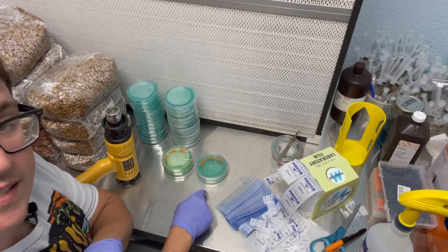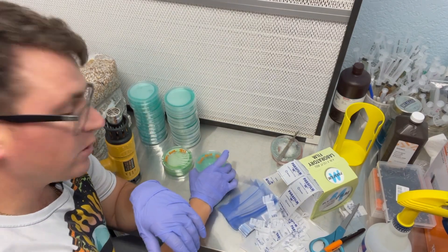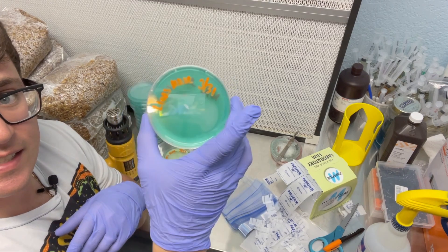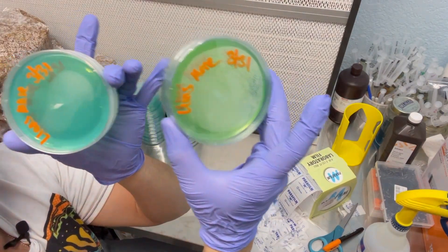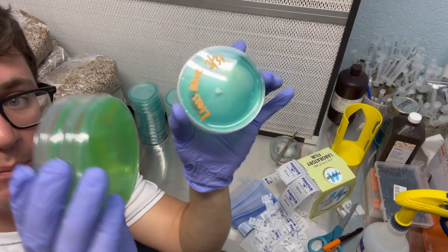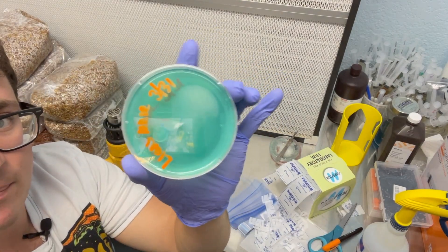Okay, so now I'm going to stick these in the incubator at 72 degrees, and I'll do some plate readings after about four or five days to see if there's any difference in growth. I try to keep the sizes pretty consistent. This is the shrink wrap and this is the parafilm.